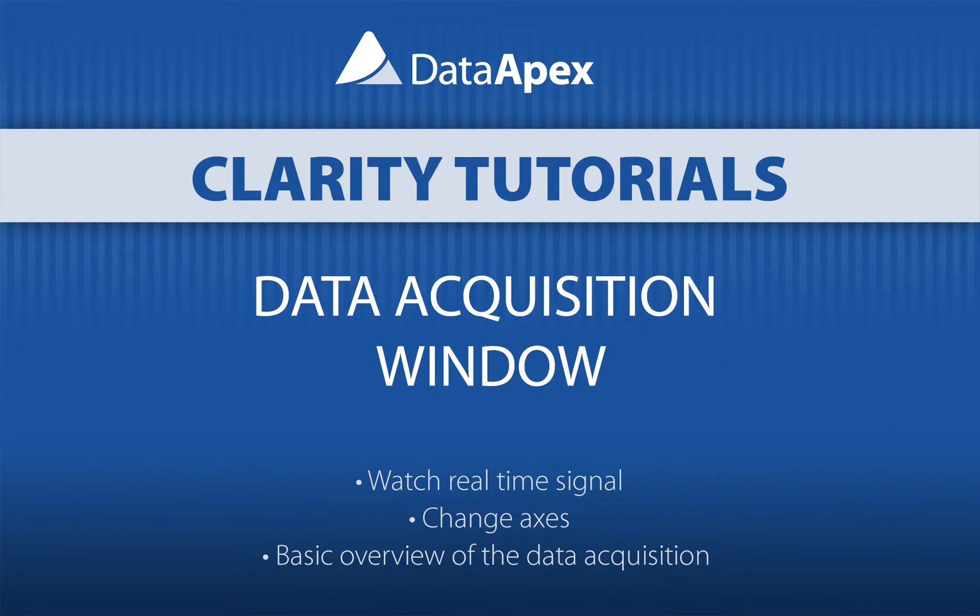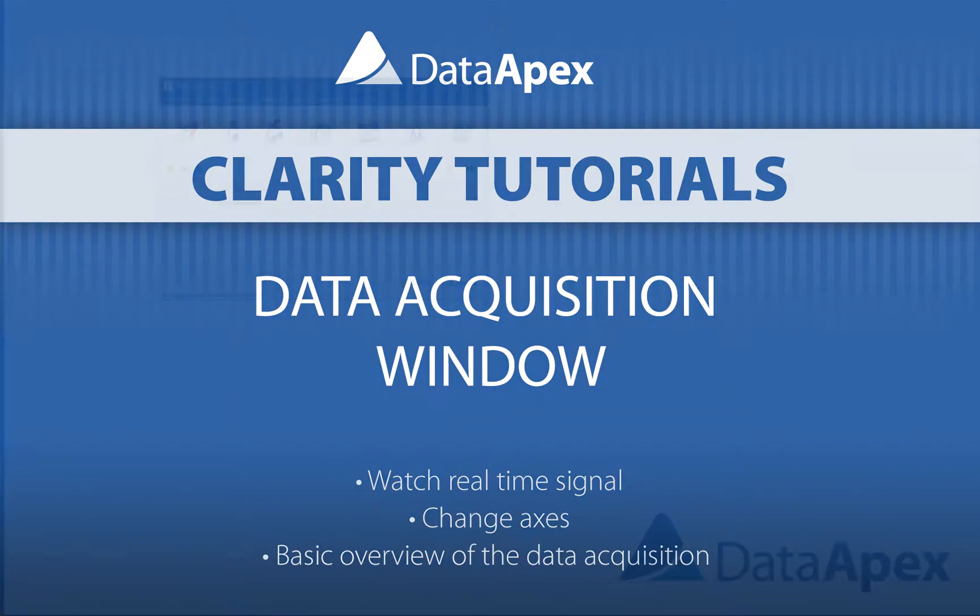Hello, welcome to Data Apex Tutorials. My name is Kristina and today I will show you how to watch real-time signal, change axis and give you a basic overview of the Data Acquisition window.